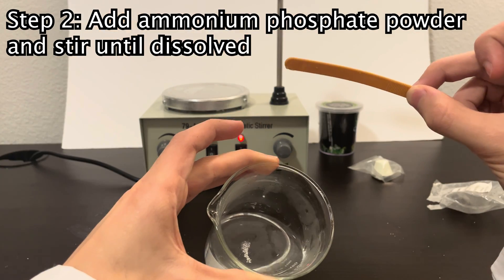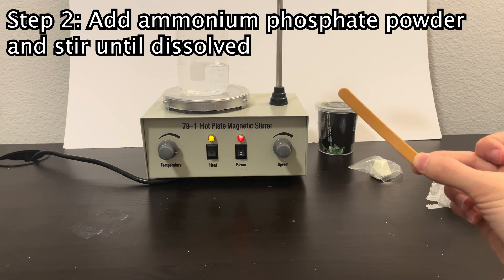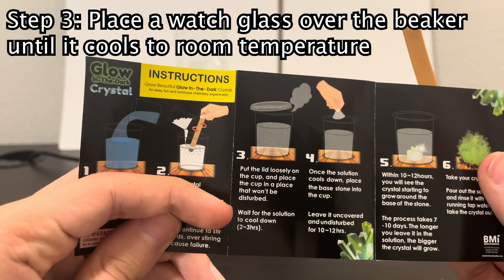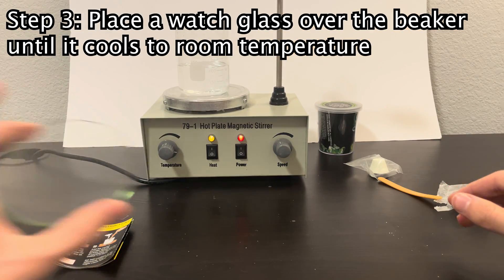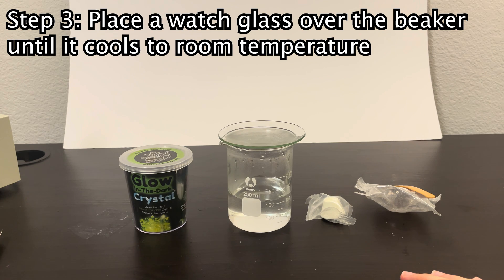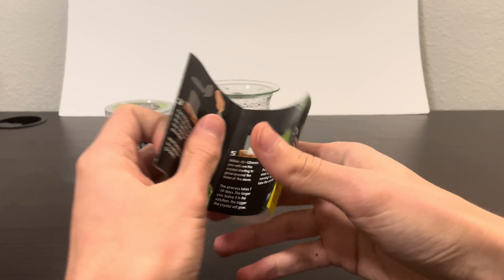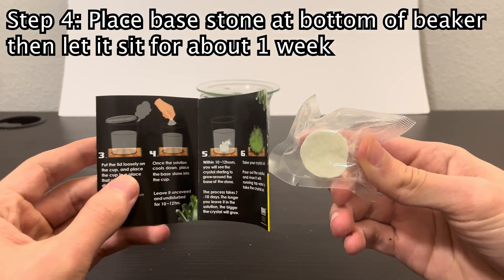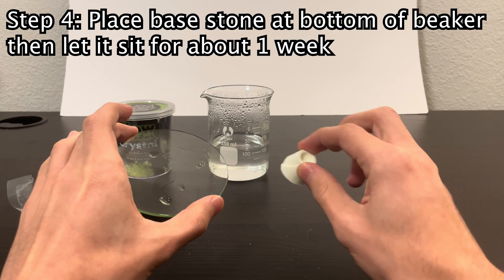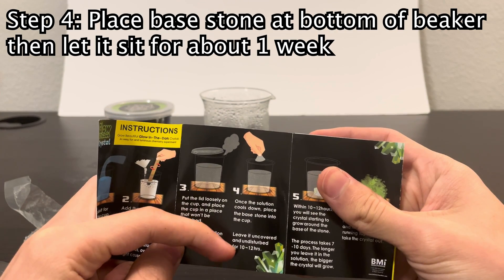There's still a little bit undissolved, but I'm going to leave it as is. Let's put it on the hot plate to maintain our heat. Now we need to put a lid on it — we can use a watch glass — and place it somewhere it won't be disturbed, waiting for the solution to cool down. So now that our solution has been sitting here for a few hours we can move on to the fourth step: placing the base stone at the bottom of the cup. I'm guessing this stone is also made of ammonium phosphate, since that's what's going to be crystallizing out of solution. Now we have to leave it uncovered and undisturbed for about 10 to 12 hours and then hopefully see some sort of crystal form.